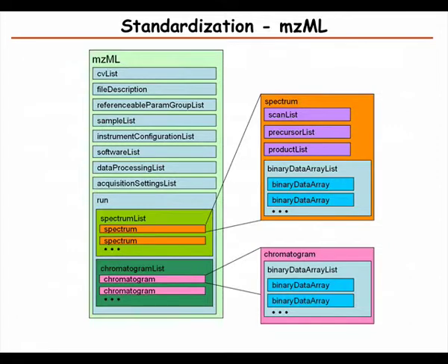So then again, if you look more in detail, the idea is that the mzML should capture mass spectrometry data, and preferably the whole complexity that we've looked at earlier: we have a chromatographic separation, we have MS survey scans, we have fragment spectra, we might have MS3, and all these things should be captured in it.